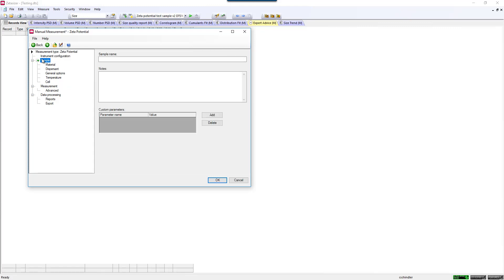You can enter the sample's name, or leave it blank. You can also enter in notes, which would give instructions to the user, such as fill the cuvette with 800 microliters of solution, check for bubbles, place the caps on the disposable capillary cell, and insert into the instrument.